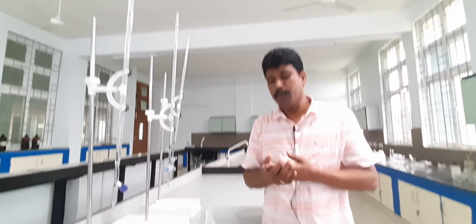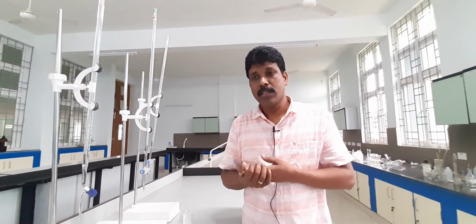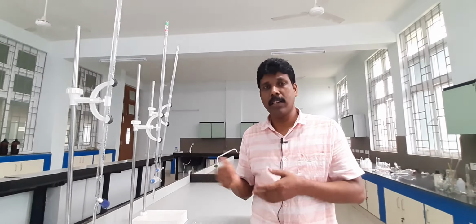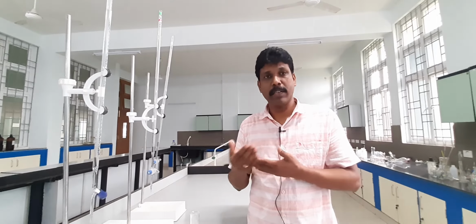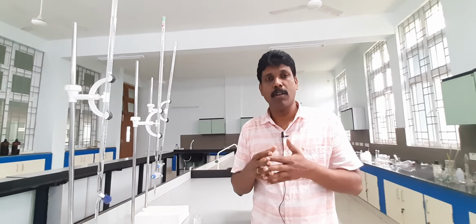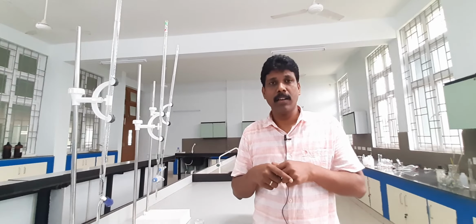After completing this experiment, you can go back and calculate the weight percentage of each solvent, each liquid phase that we are taking. Then, by looking at the percentage compositions, we can take a graph sheet wherein we can plot the binodal curve by first drawing an equilateral triangle.